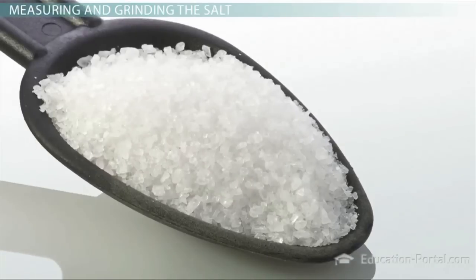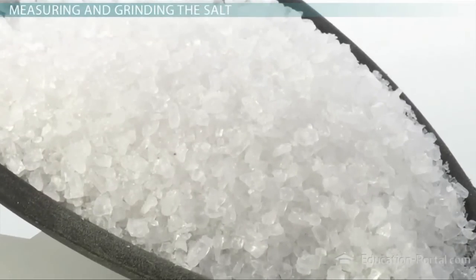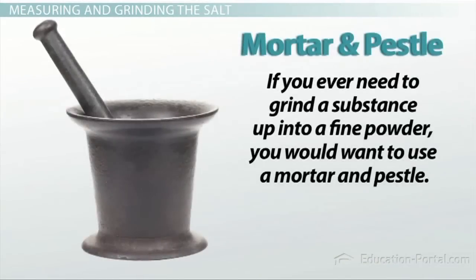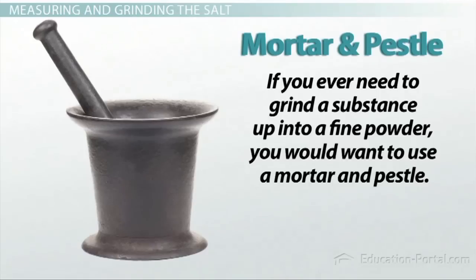Once we measure it out, we notice that the salt has large chunks, and it may take a while to dissolve to make our solution. If you ever need to grind a substance into a fine powder, you would want to use a mortar and pestle. This will increase the surface area on our solid by breaking it up into smaller particles and allow us to dissolve it into solution a lot quicker.